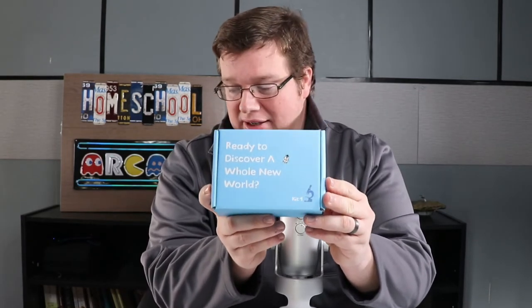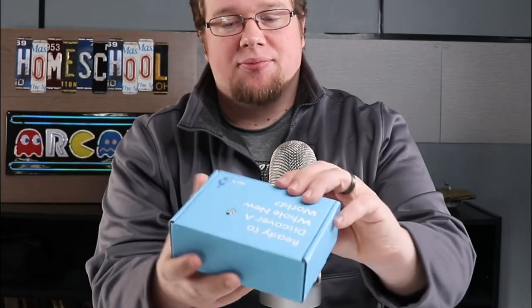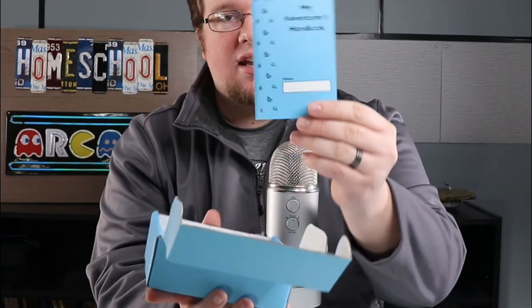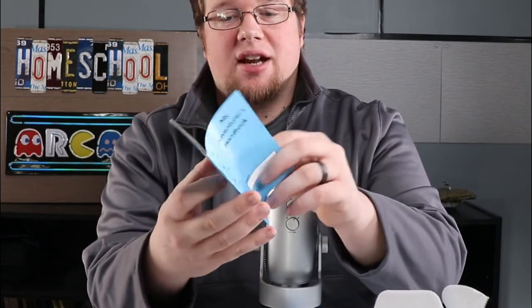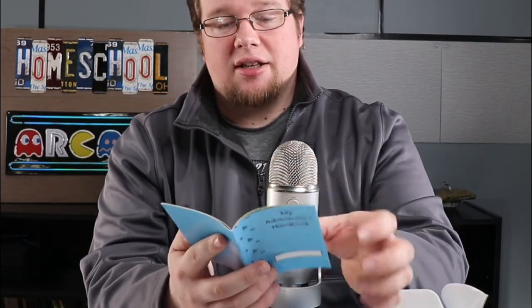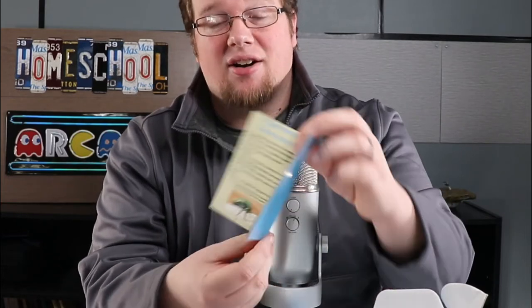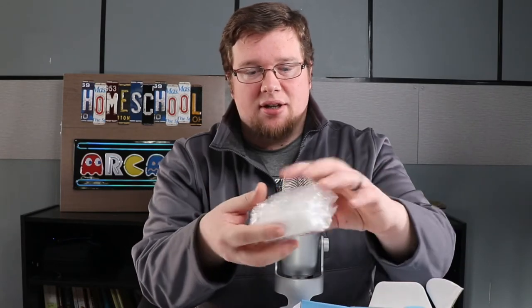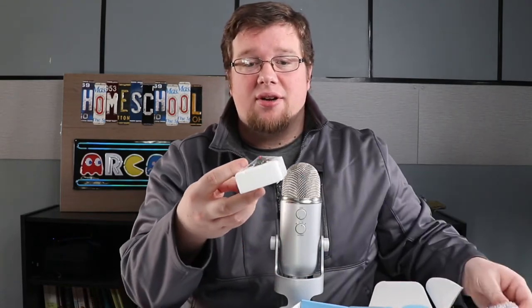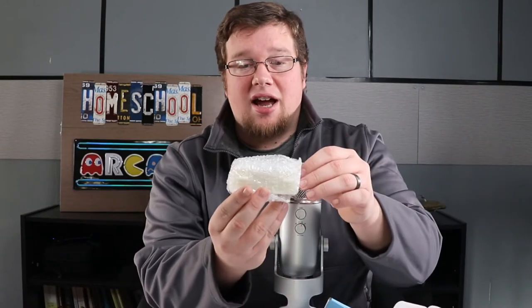We're going to take a look at this Bug Edition microscope slide kit. We pop this open and it comes with a neat little handbook. The handbook gives kids a chance to not only learn, explore, and read, but also interact with the slides within the kit. Here we have our beetle — we open that up and this is a real beetle, not a fake plastic beetle.